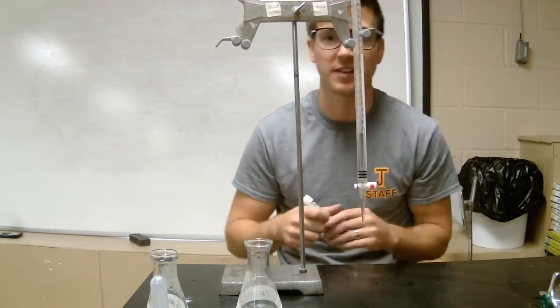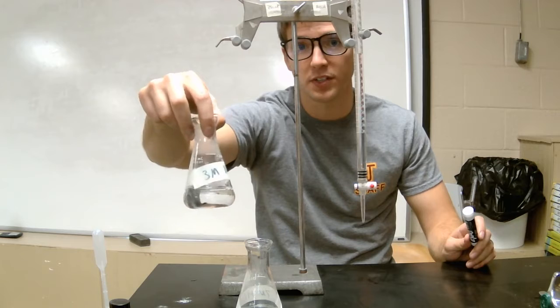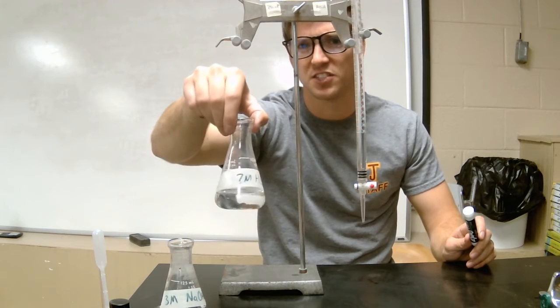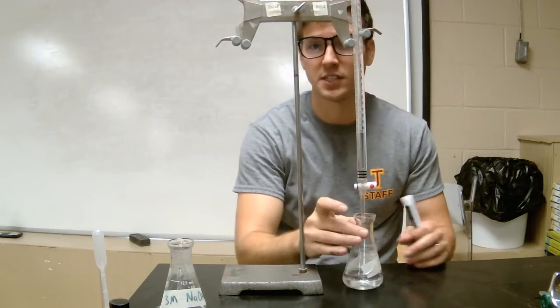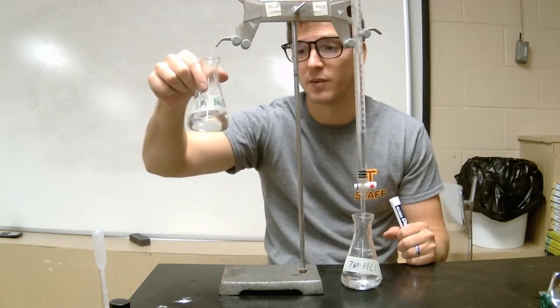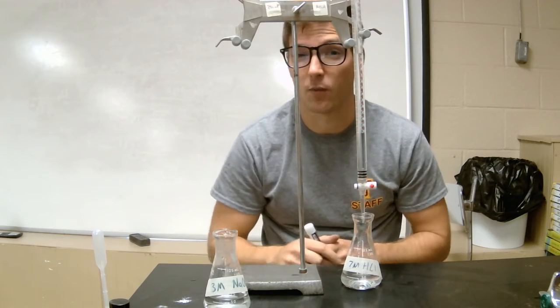I got my burette here, and I got a known concentration of NaOH, 3 molar to be exact. And then I got this unknown concentration of HCl. That's a question mark, not a 7. It's unknown, okay? So what I'm going to do is put the titrate underneath here. I'm going to titrate it with the titrant, and then a color change should occur, and then we can do some calculations here to figure out what's going on.